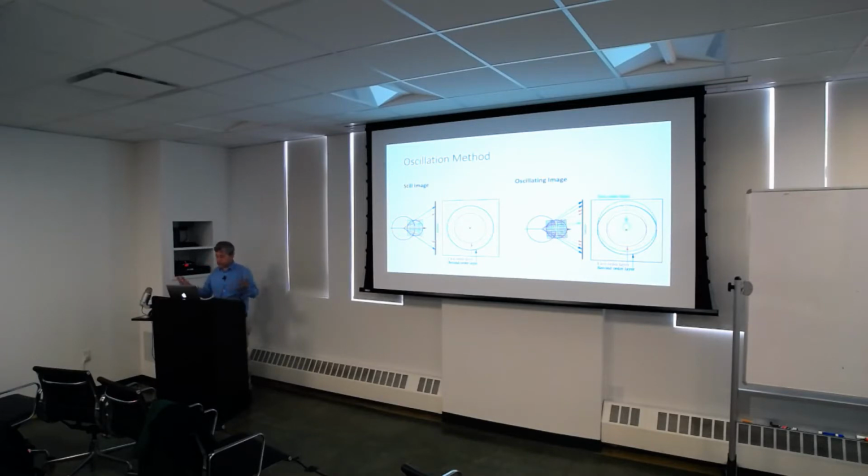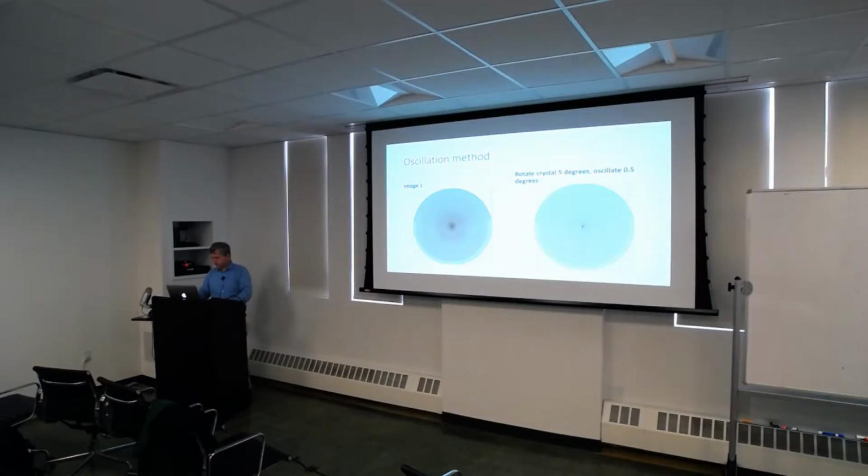And I think that's pretty much all programmed by whatever beam line you're using, or set as parameters, I'm not sure. Anyway, this is all very standard and well understood X-ray crystallography for a long time. Okay, so here's what it practically looks like.